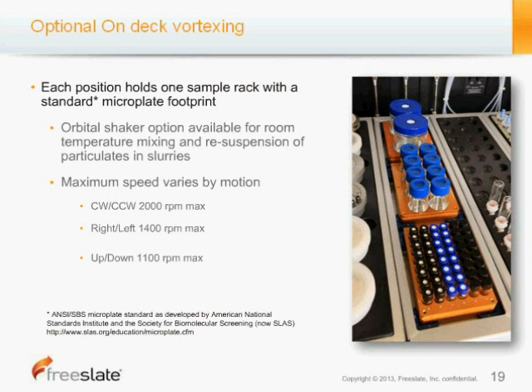The plates that the system holds are standard microplate format. So what you would do is get a microplate, get a plate holder with the size holes that you need for your different vials. And so the vortexer can accommodate many different sizes of vials and plates.